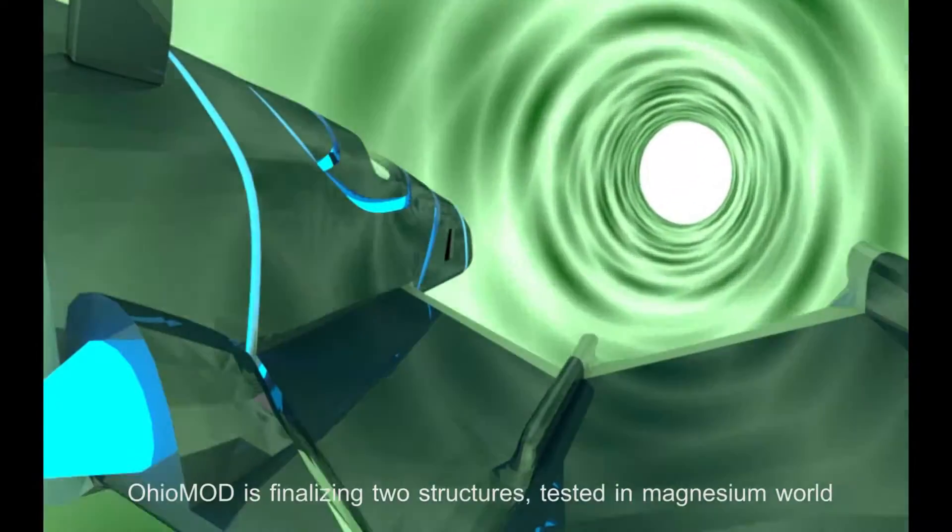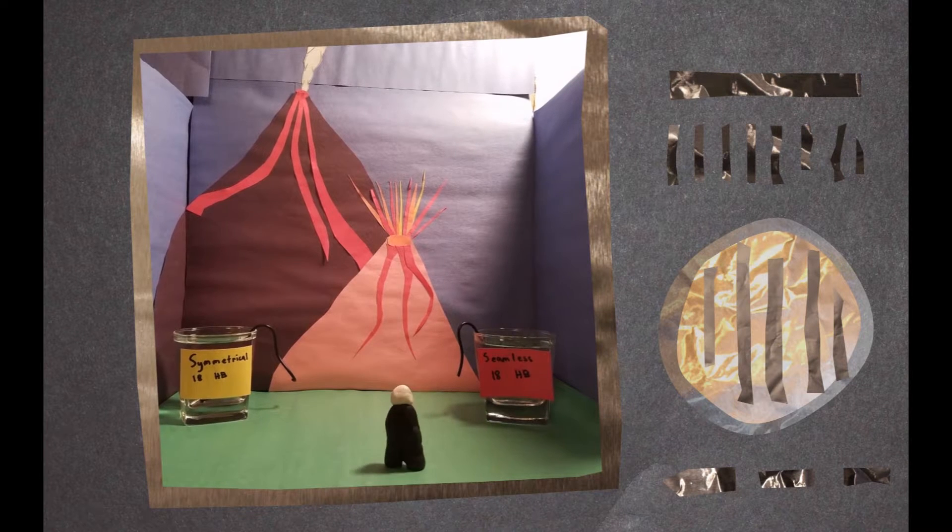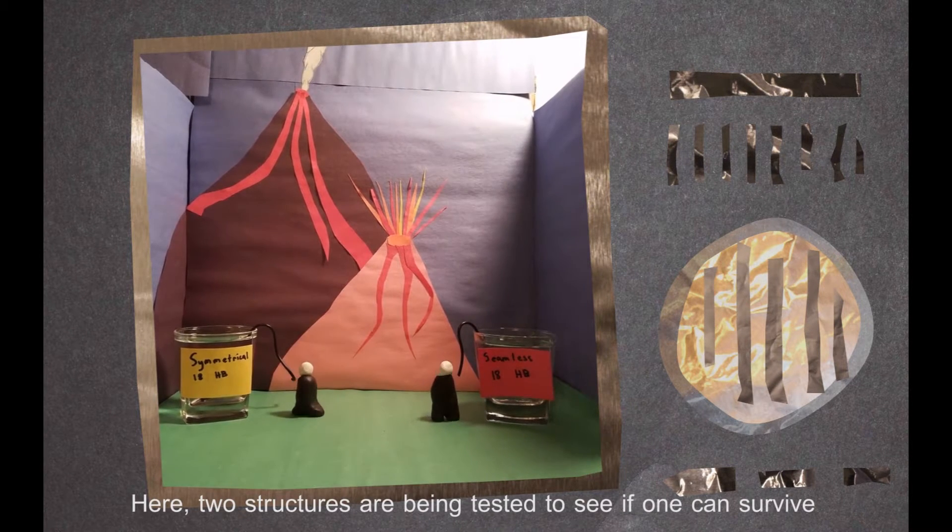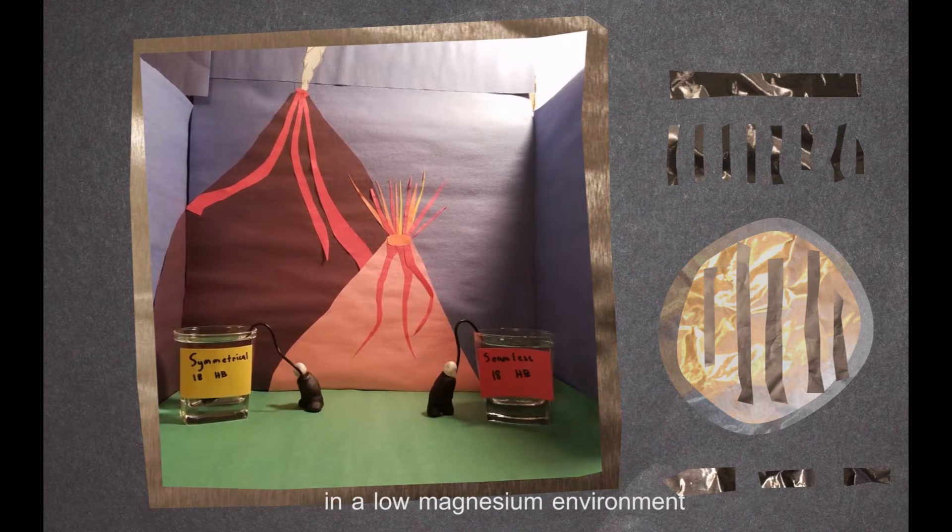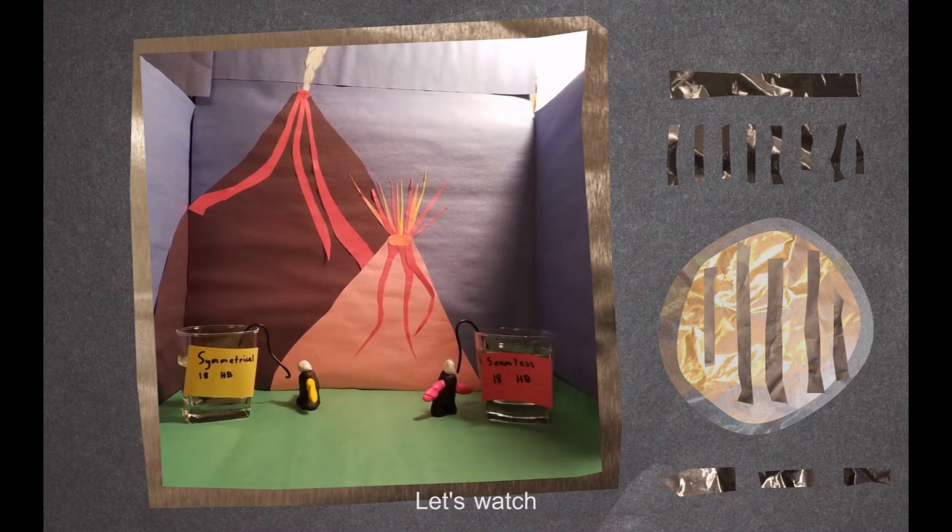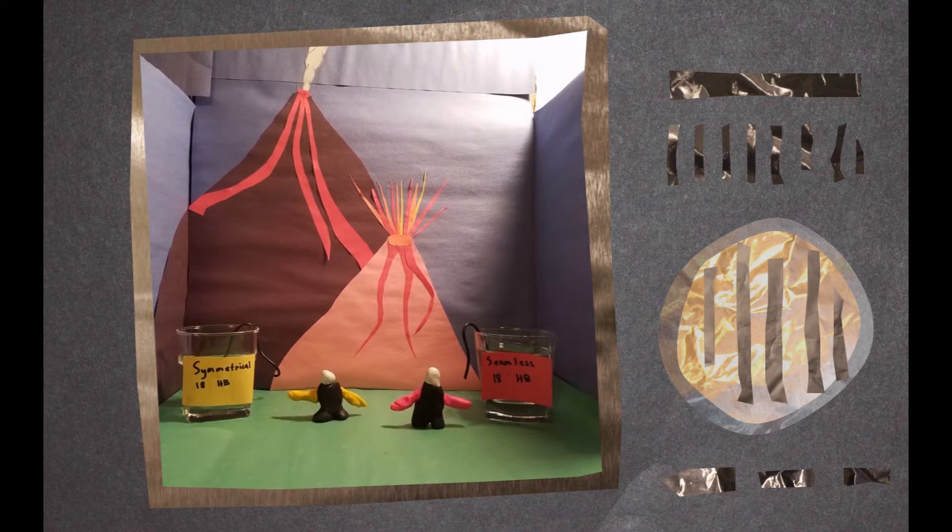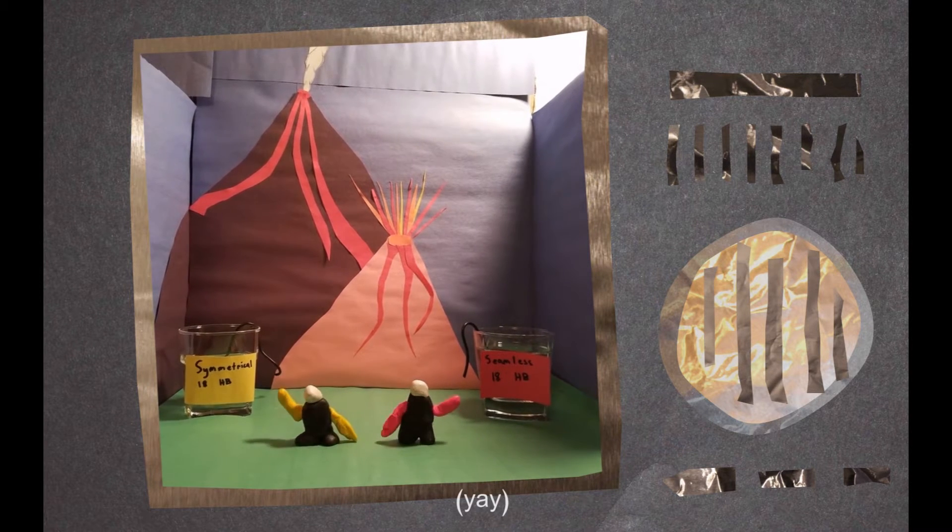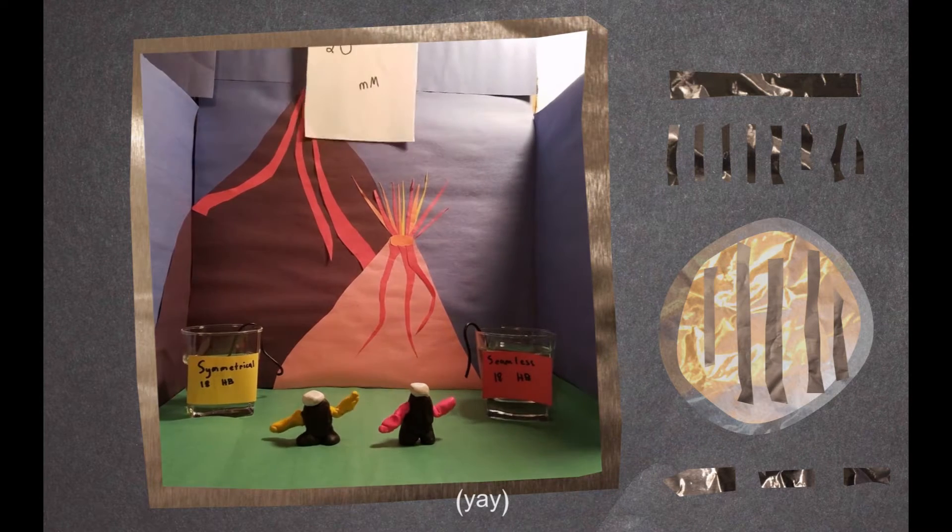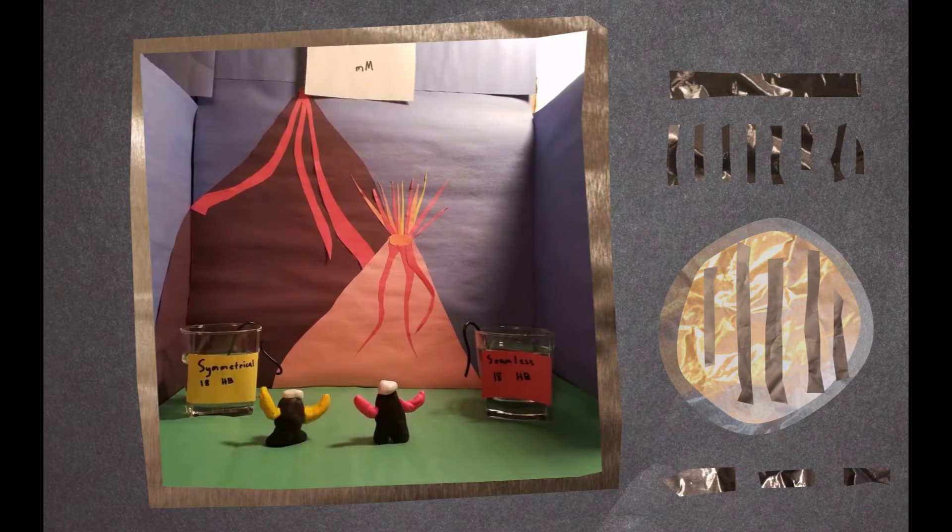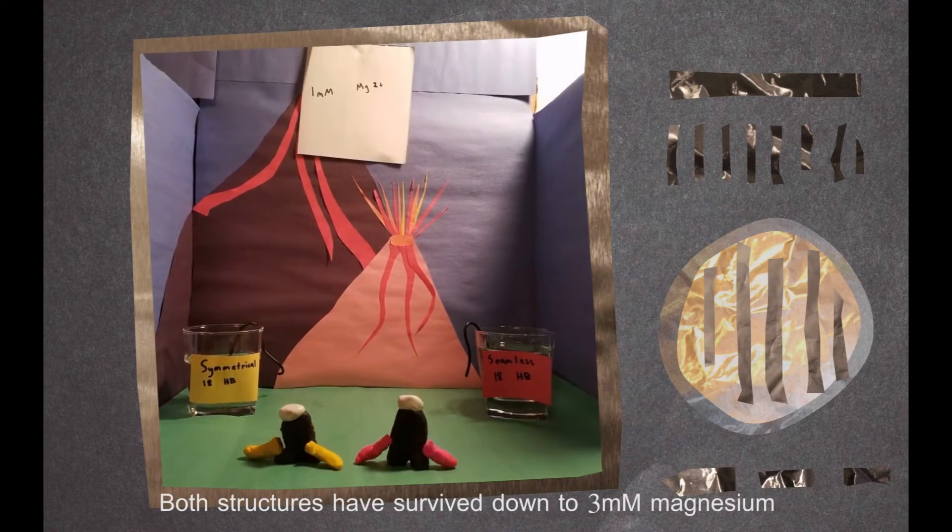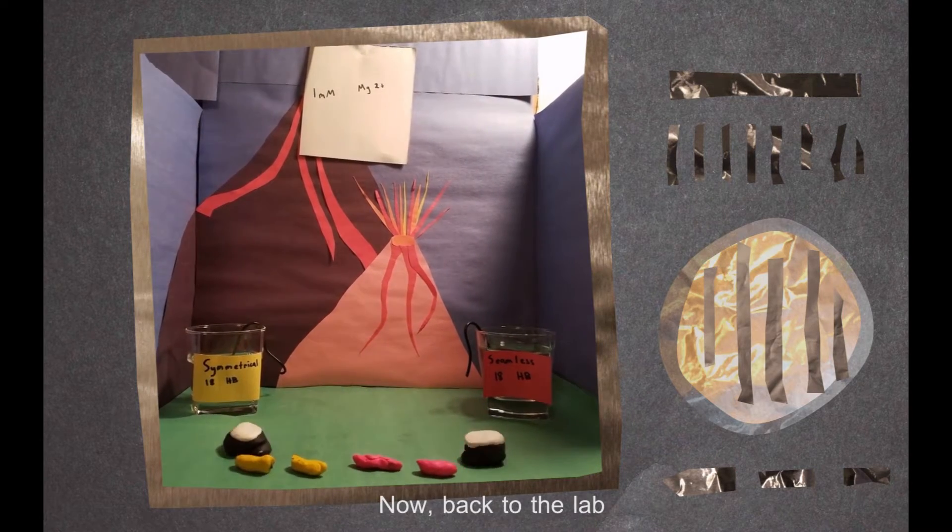OhioMod is finalizing two structures tested in Magnesium World. Here, two structures are being tested to see if one can survive in a low magnesium environment. Let's watch. Both structures have survived down to 3 millimolar magnesium. Now, back to the lab.